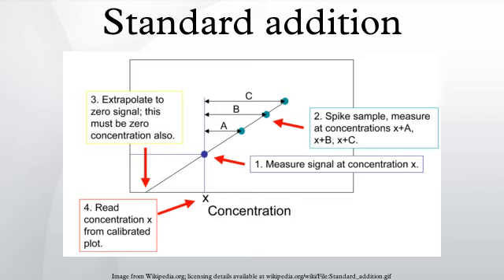In other words, in using pure solutions to establish the calibration graph, it is assumed that there are no matrix effects, that is, no reduction or enhancement of the silver absorbance signal by other components. In many areas of analysis such an assumption is frequently invalid. Matrix effects occur even with methods such as plasma spectrometry, which have a reputation for being relatively free from interferences. The method of standard additions is usually followed to eliminate matrix effects.